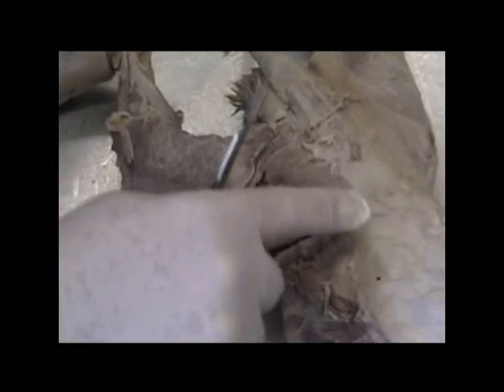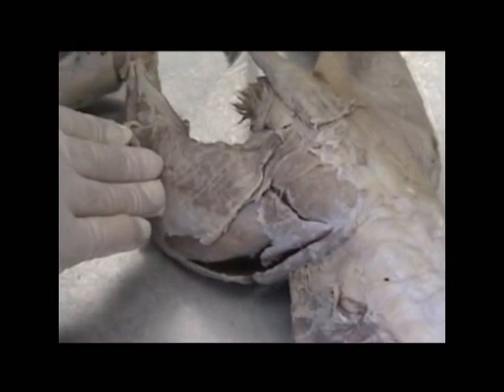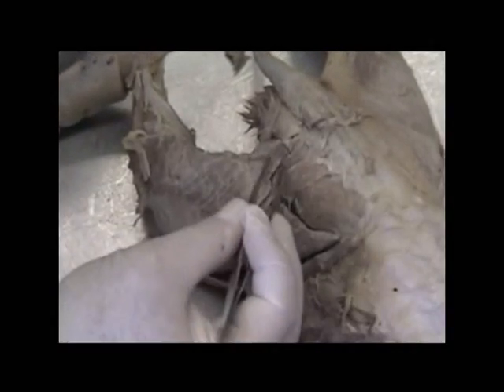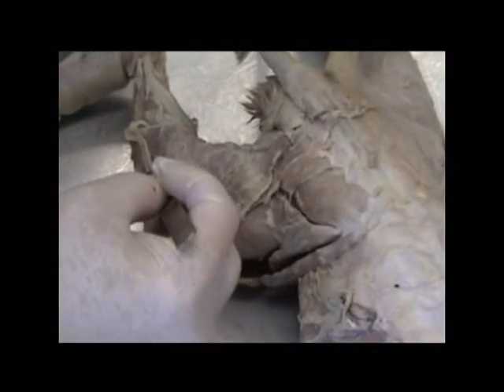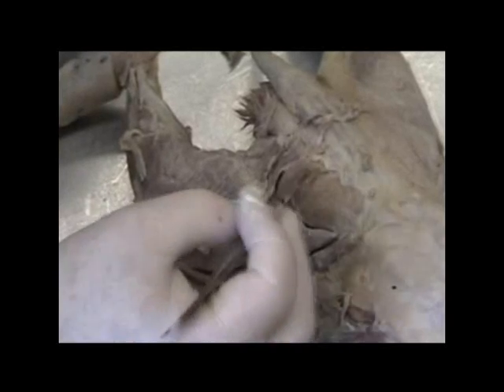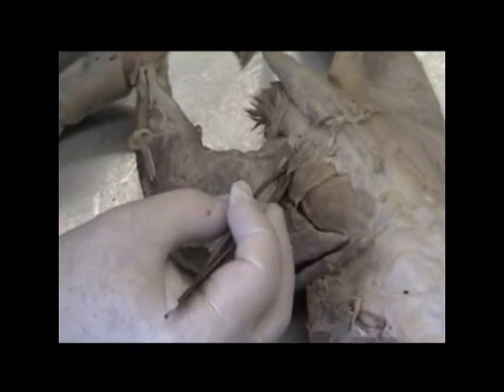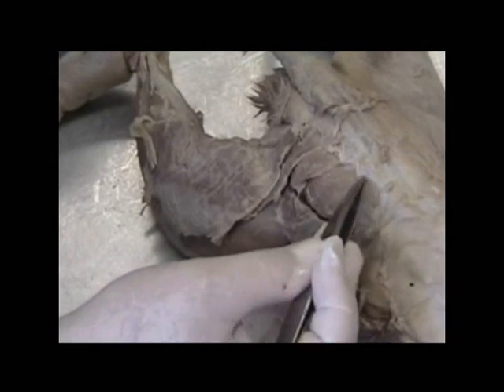Look now at some muscles that are found in the rump of the animal, down in here, and then we're going to take a look at some superficial muscles that run down on the lateral portion of the leg. If we look up at these butt muscles as they were, what we see is that there is a large muscle here, comes all the way down. It actually has two bellies to it, and this is the biceps femoris, origin and insertion. Right in front of that, working toward the head of the animal, is the caudofemoralis. Right in front of that is the gluteus maximus. In front of that is the gluteus medius.